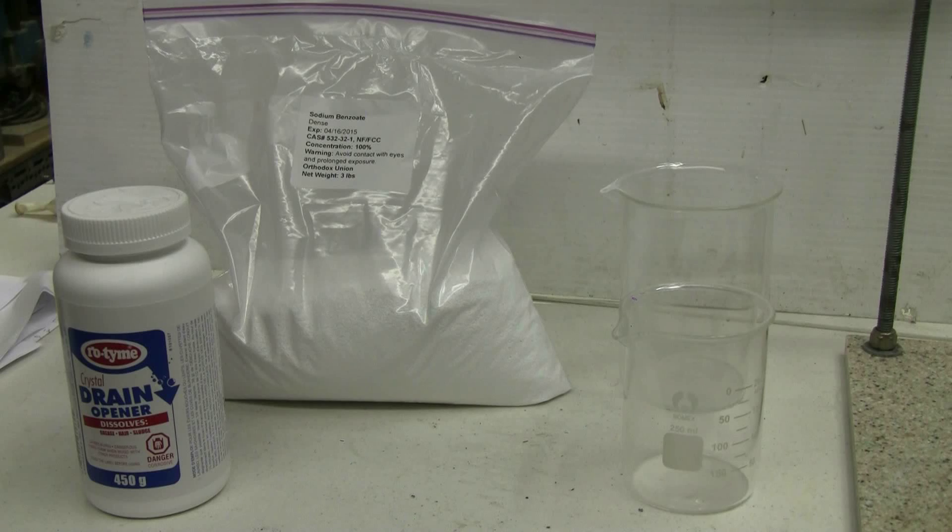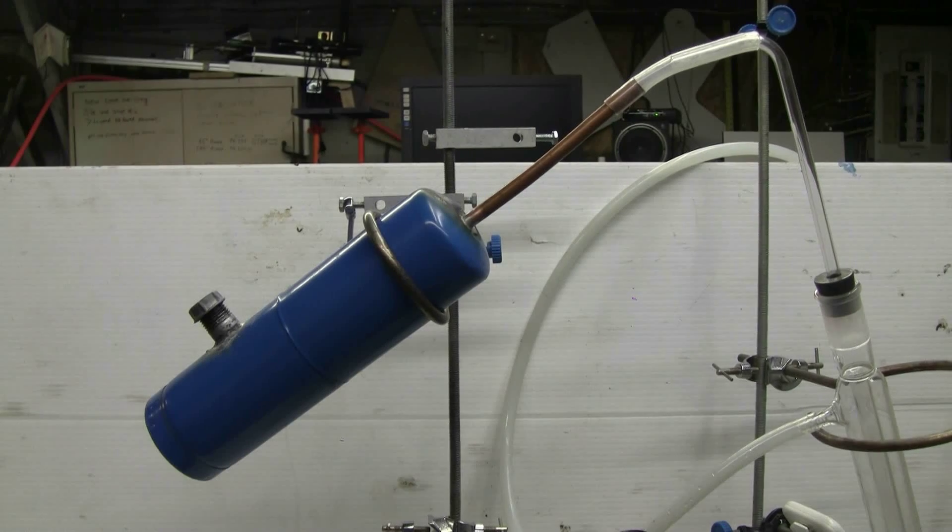My sodium hydroxide is in the form of a crystal drain opener. There's some little bits of aluminum or zinc in it that I've tried to pick most of them out, some are still there but it shouldn't interfere with the reaction I'm hoping. The sodium benzoate is just a standard bag of food grade sodium benzoate that's widely available online from many suppliers.